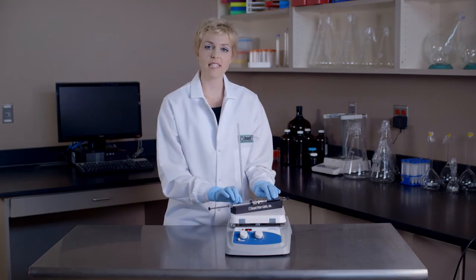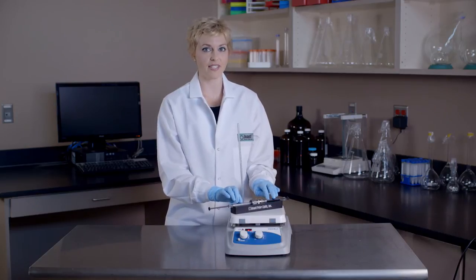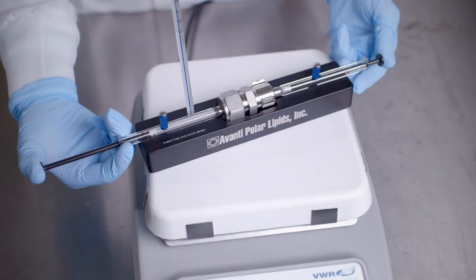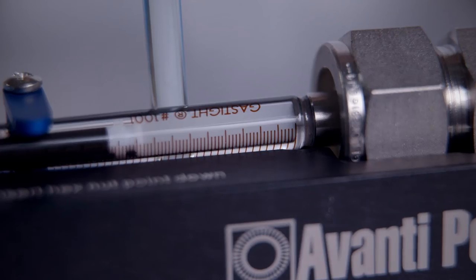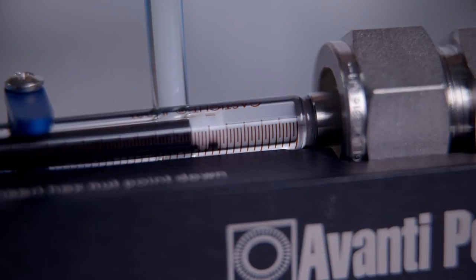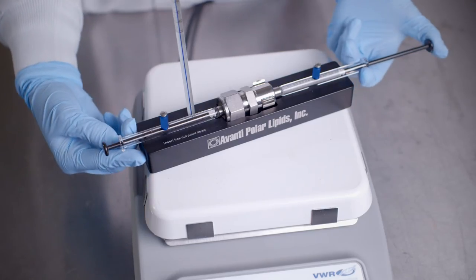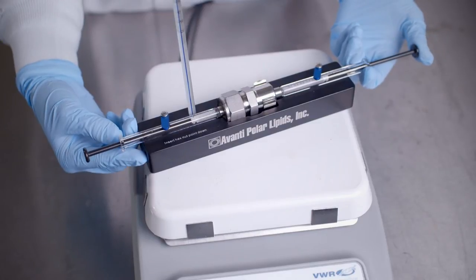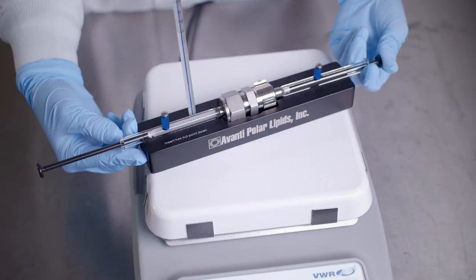Allow the lipid suspension to equilibrate to the temperature of the heating block for approximately 5 to 10 minutes. To extrude, gently push the plunger of the filled syringe until the lipid solution is completely transferred to the alternate syringe. Then gently push the plunger of the alternate syringe until the lipid solution is completely transferred back to the original syringe.